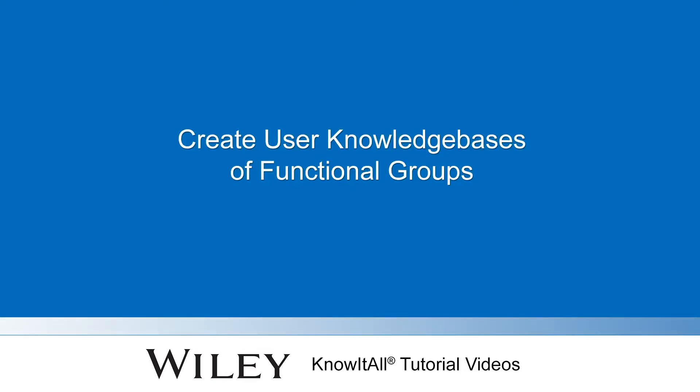Welcome to a demonstration of how to create user knowledge bases of functional groups for use in the Know-It-All Analyze-It IR, Raman, and Polymer IR applications.